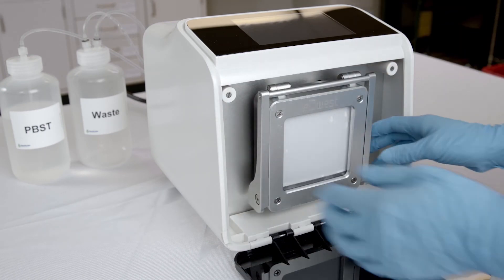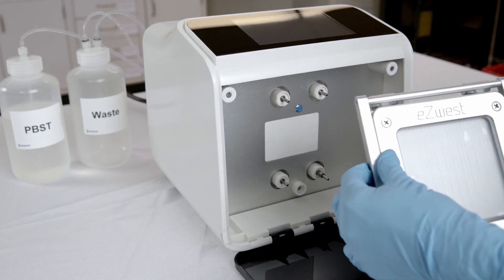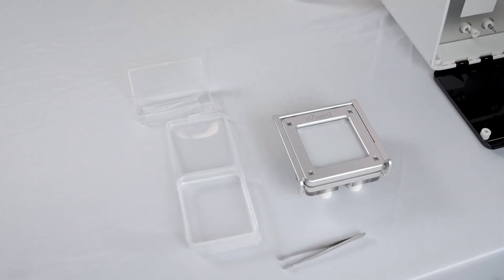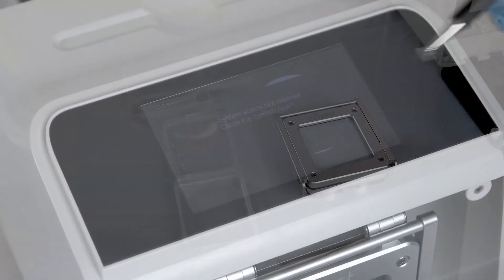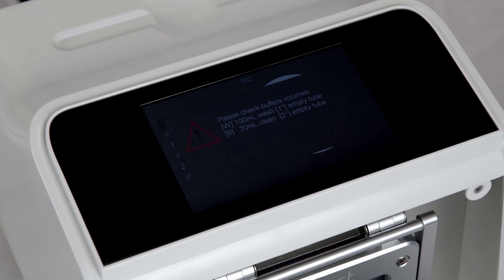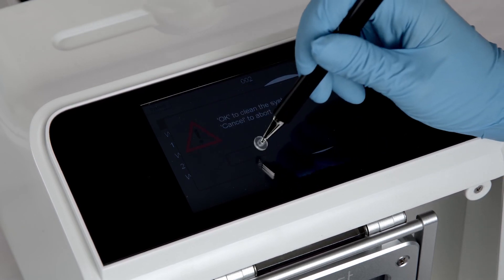After the program is finished, take out the cassette and the membrane is ready to be used for the detection step. Always run a cleaning cycle in between each Western to maintain the cleanliness and upkeep of the device.